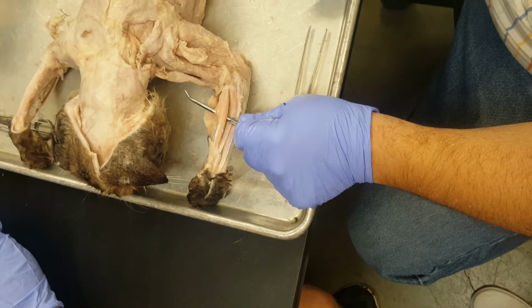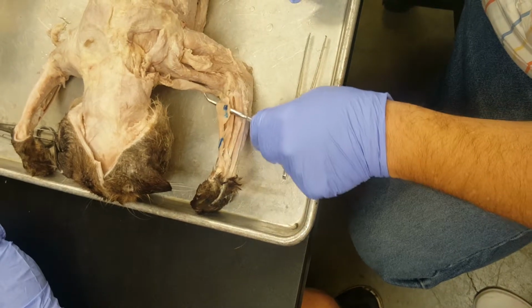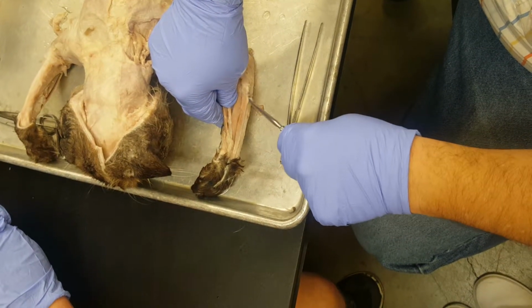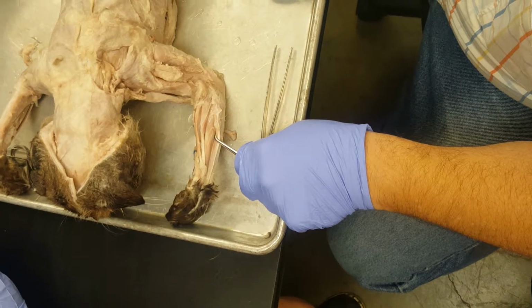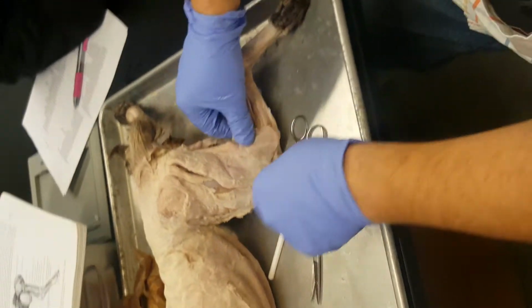Et means and. And then this is your brachioradialis, which I actually did not cut completely off, surprisingly. Okay, and then in between here is your supinator, made famous by Arnold Schwarzenegger, the supinator. Okay, supinator. Got it?